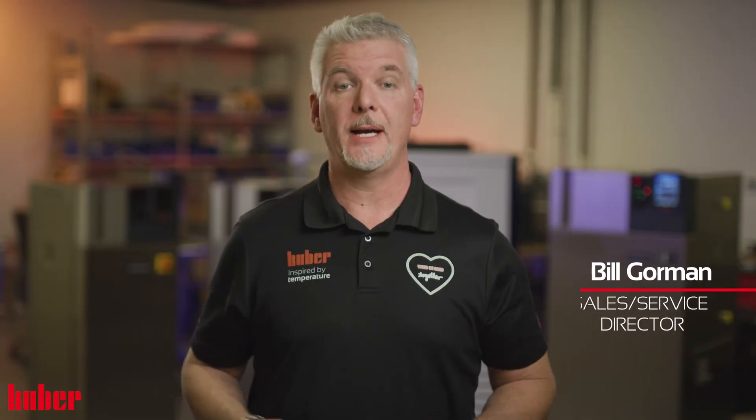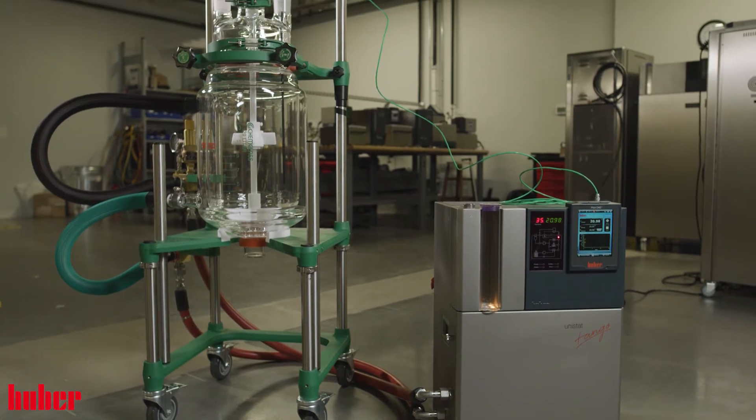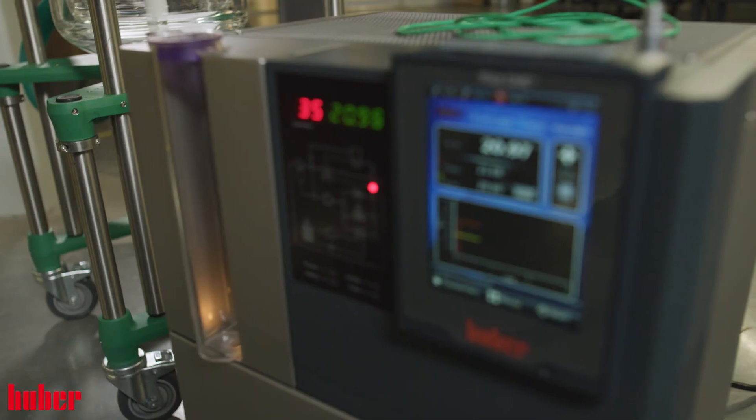Let's talk about our 405 reactors — more specifically, how our temperature control units pair so well to them. Our Unistat 405 is a very popular unit for 10 to 50 liter glass jacketed reactors. From exothermic reactions to recrystallization, heating applications, and everything in between, our Unistat 405 is ready for the task.